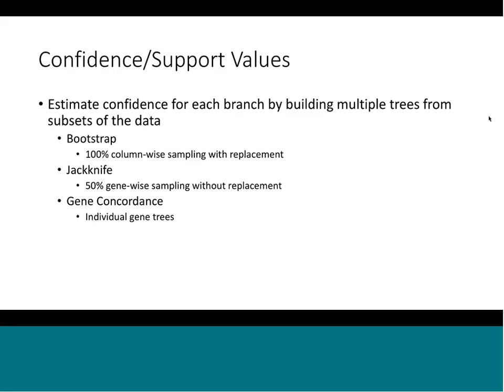You can imagine a situation where there could be a group of protein families that could have undue influence on a tree. They could be way off, and jackknifing is a way to see if specific protein families are messing around with the tree, if there's an outlier character that might have a disproportionate influence on the relationship. So jackknifing is a way to get around this, and jackknifing is actually what we do.